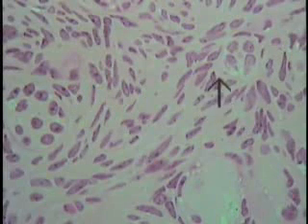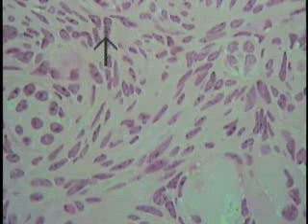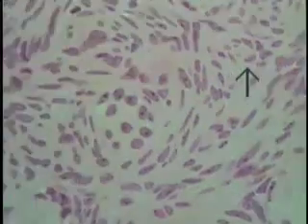The nucleus stains basophilic. Usually when one sees a clumped nuclear pattern, this clumped, deep colored material is referred to as heterochromatin. The lighter type of material in the background, the more active form of DNA, is oftentimes referred to as euchromatin.